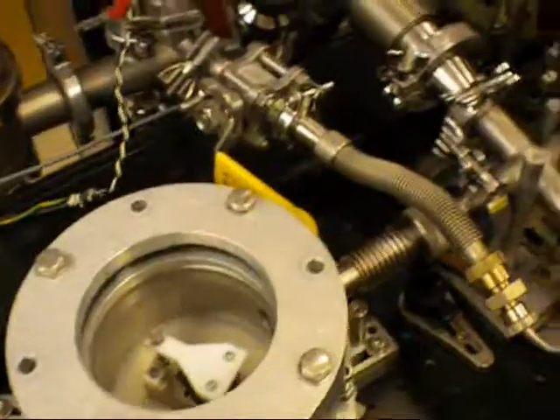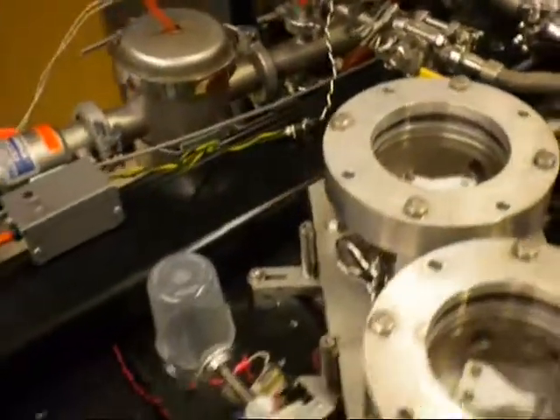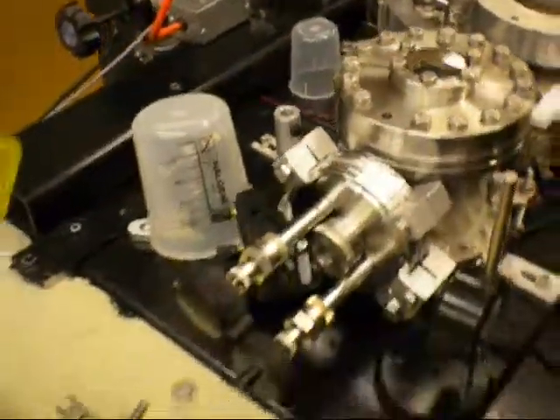Because it's the spectral output of the laser that we look at using a large monochromator coupled with a diode array detector.